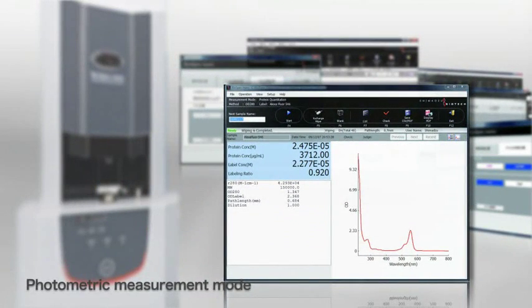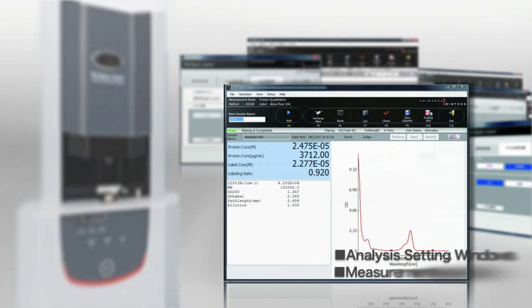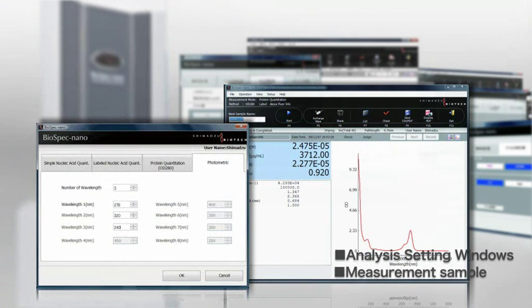This feature allows displaying and printing the optical density values along with wavelengths and optical path lengths for up to 8 specified wavelengths.